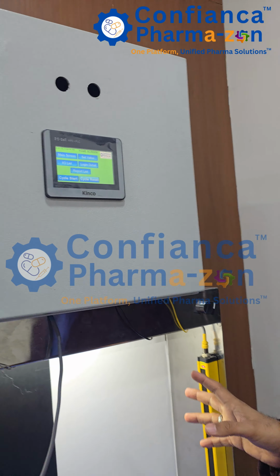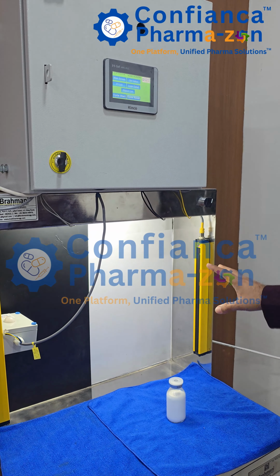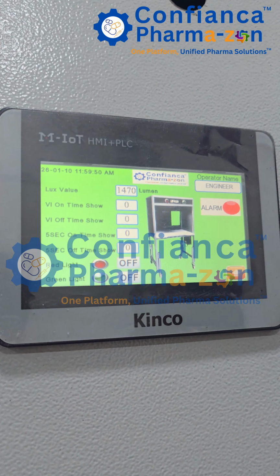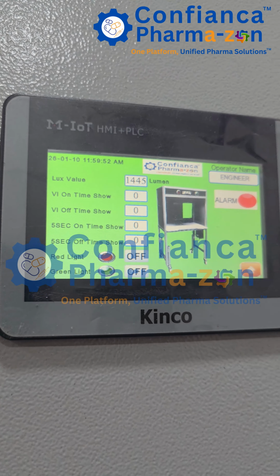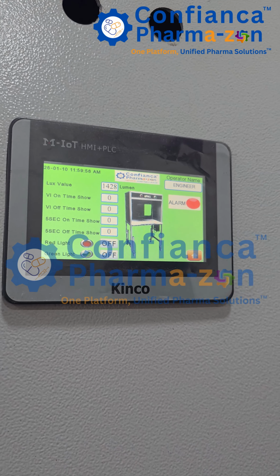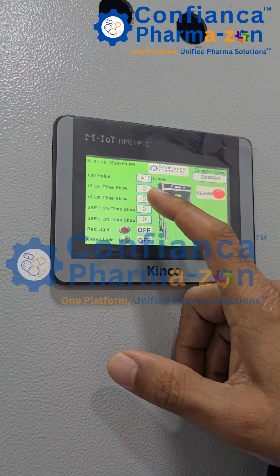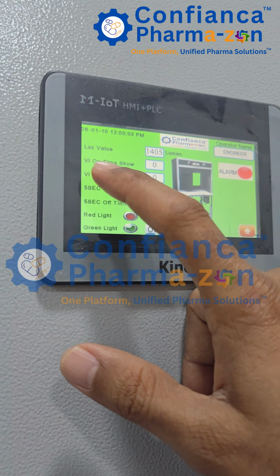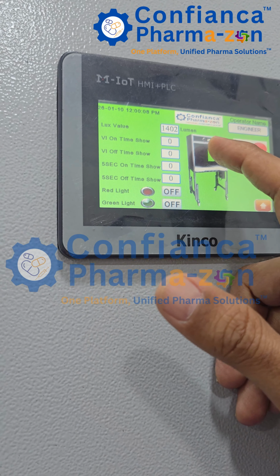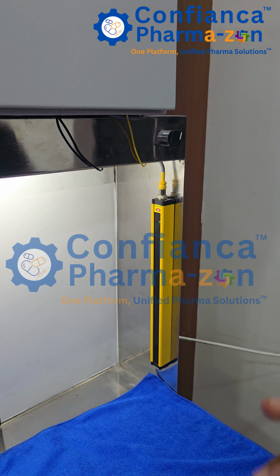As soon as I do the cycle start, you can see the power is turned on and it is running the LEDs. On the main screen, you can see 1470 lux from the LED that we have installed. This will increase to 2000, 2500 depending on the more LEDs that we install. Now the timer will run in visual inspection on time, in minutes, and the off time also in minutes, and then the 5-second timer. Let me show you how the 5-second timer will work.